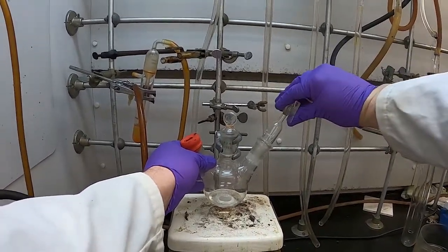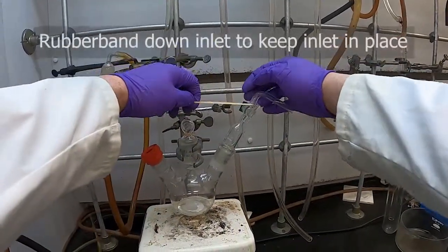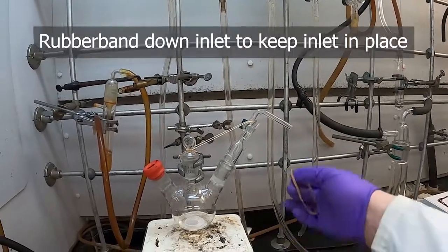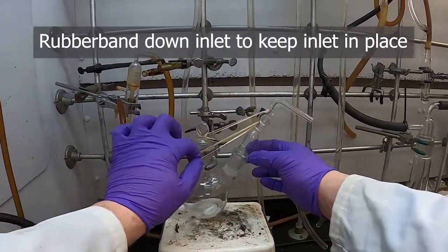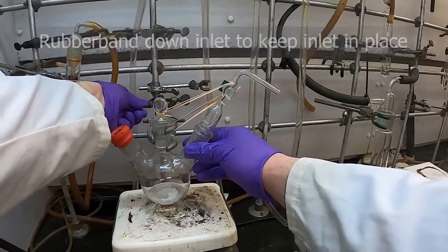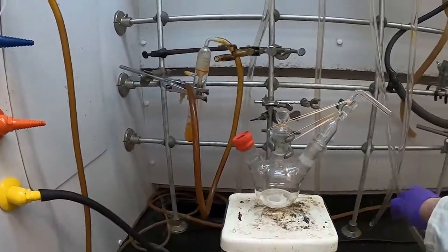Get that rotated so we get a nice seal. And then we also want to attach some rubber bands to keep it there so that it doesn't pop off while we're using the apparatus here. And I'm going to use two. Different clamps will give you more options for positioning of your rubber bands. So that should be good.